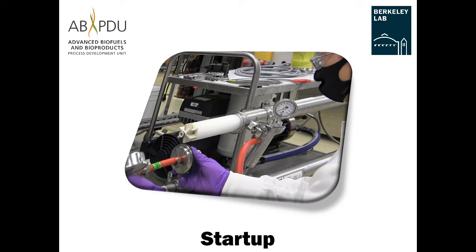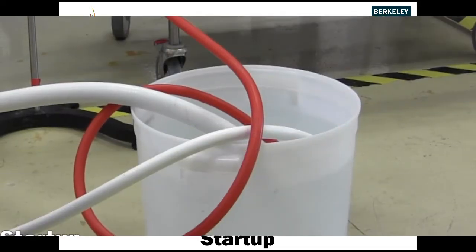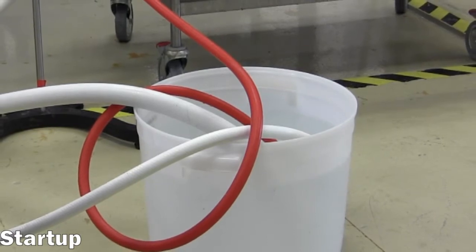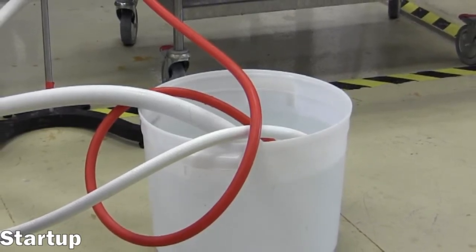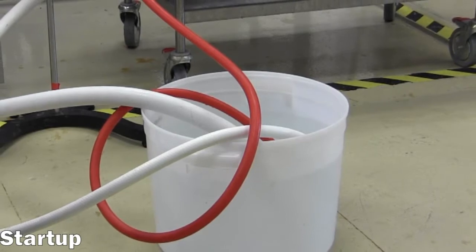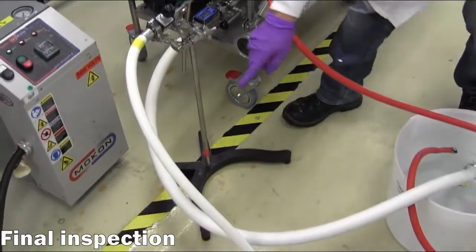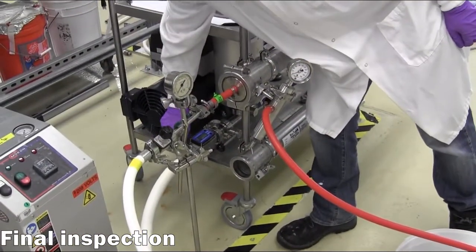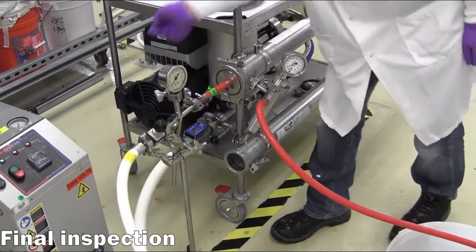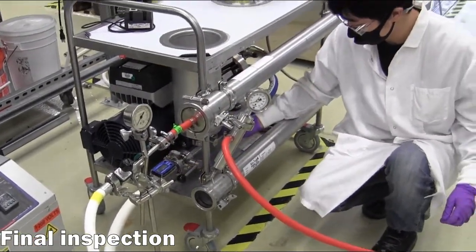Startup: The operation begins with all the inlet and outlet hoses placed in the water bucket to recirculate while the system primes. Ensure all valves are open, clamps are secure, and there is no back pressure applied on the retentate outlet manifold.